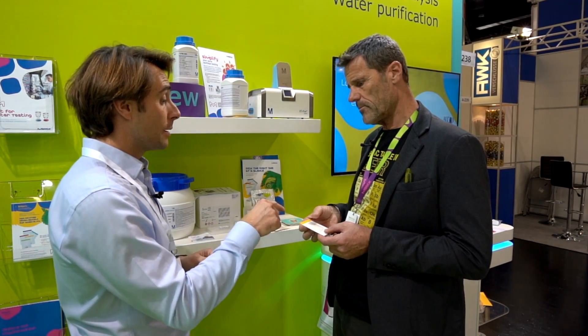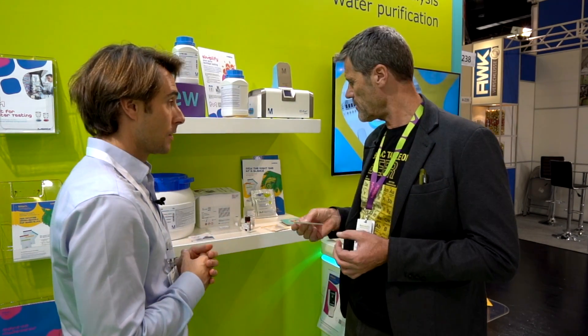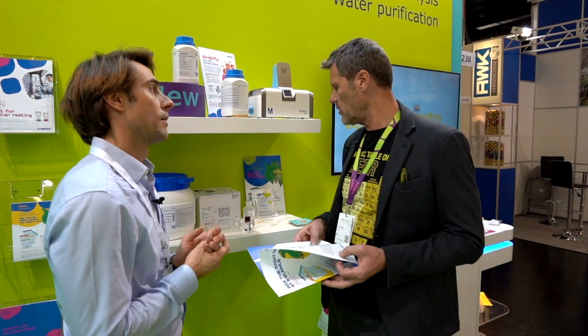We always have 25 pads per pack. You are also able to pick colonies from here to do identification or further analysis — that's no problem. The price is approximately one euro per test.